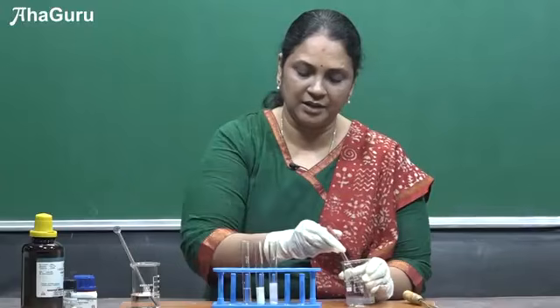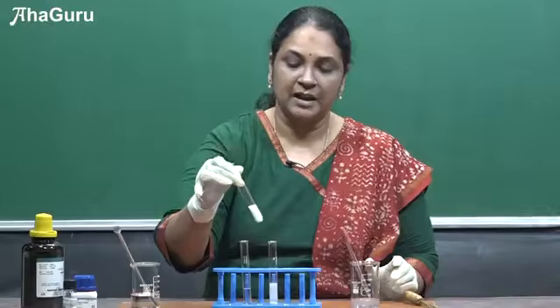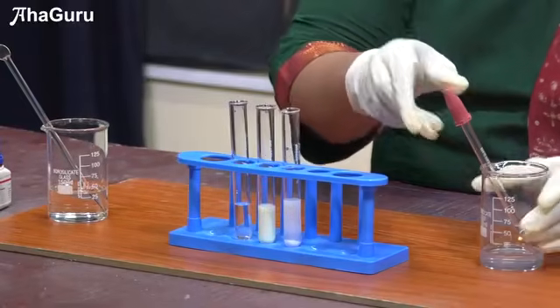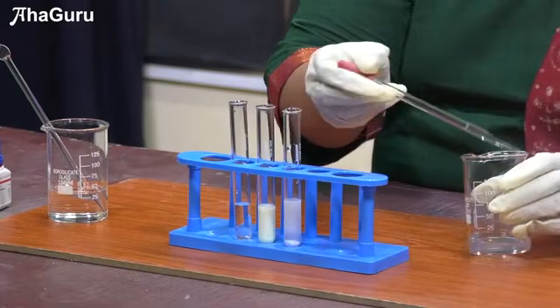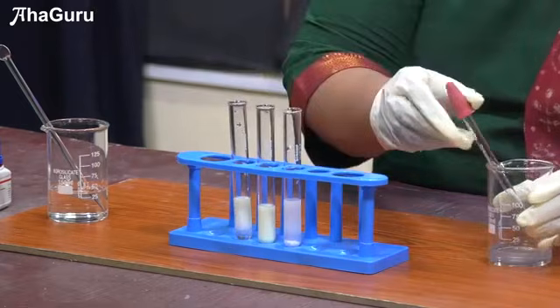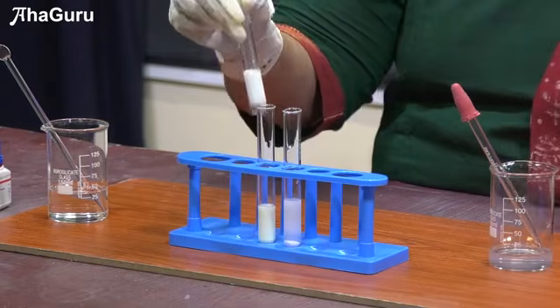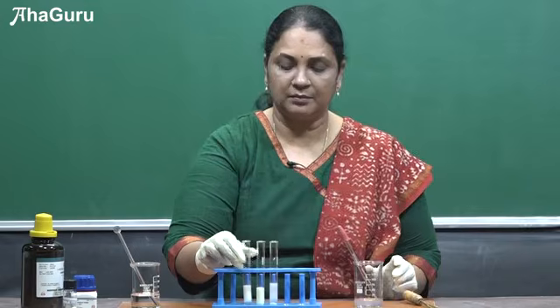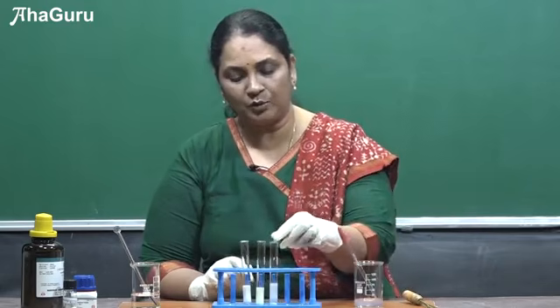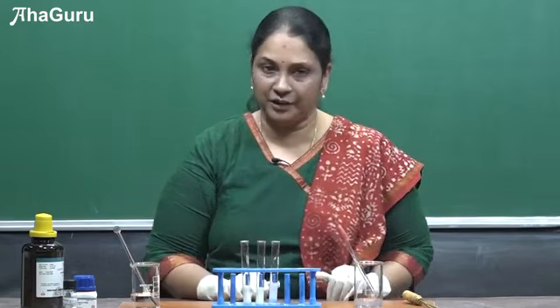You can see the change in color. This is again AgBr precipitate, and you can see it is pale yellow in color. Now I am going to add silver nitrate to the iodide solution. You can see this also turns slightly yellow. Sometimes we cannot differentiate between the color. You can see these two are pale yellow, but the chloride precipitate is absolutely white.